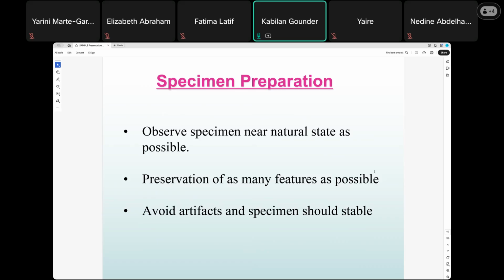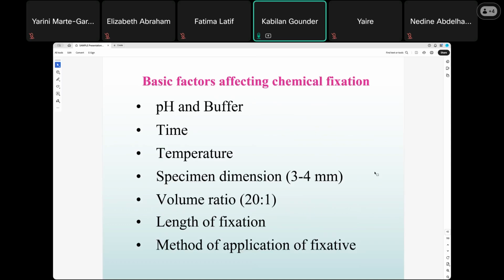Usually we preserve the samples for light microscopy with paraformaldehyde. Occasionally the investigators want to use glutaraldehyde along with the paraformaldehyde. So if you process these samples, the fixative is important and the diluent is important.